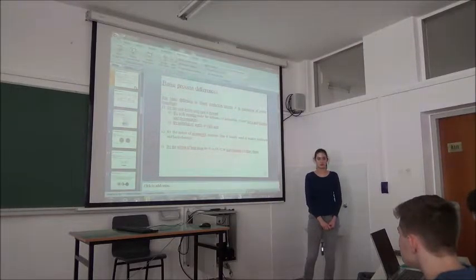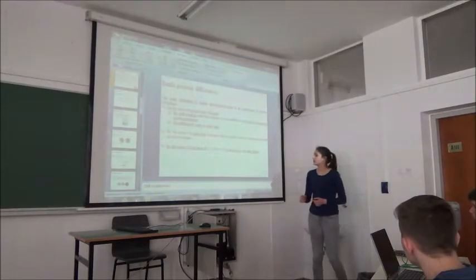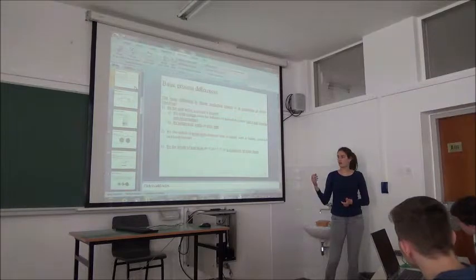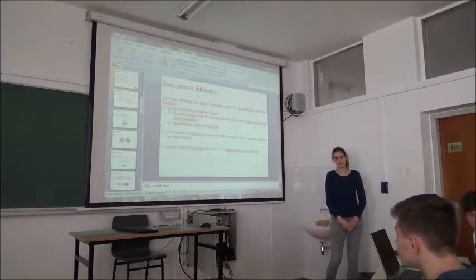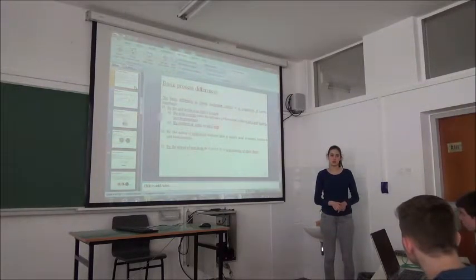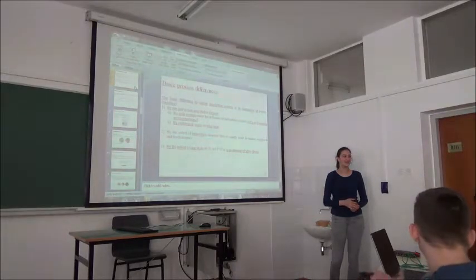What is SH? What does it show you, and how is it different from pH? It is the number of milliliters multiplied by 1,000 of NaOH that we have to use to make the phenolphthalein in the milk go purple. When the phenolphthalein is purple, what does it mean to you? Is it neutral, acidic, or the third one? Here comes the third one. Okay. I'm not sure how to say it. Basic, yes.